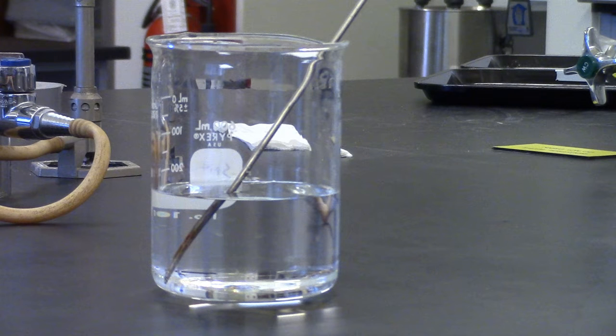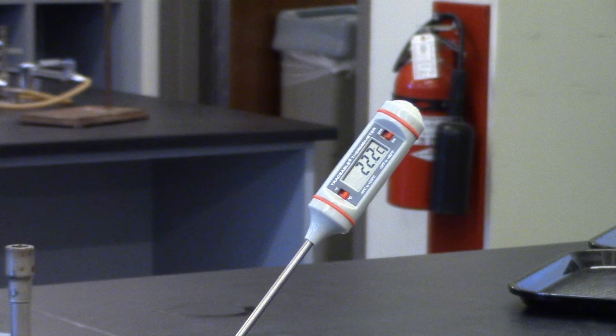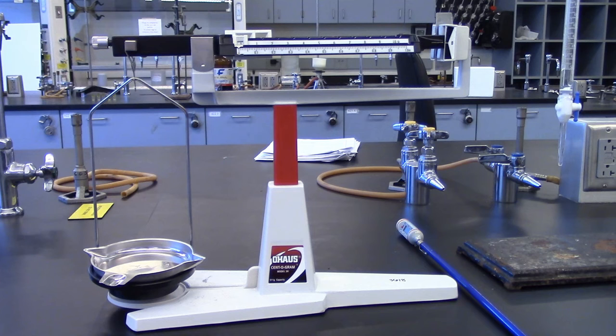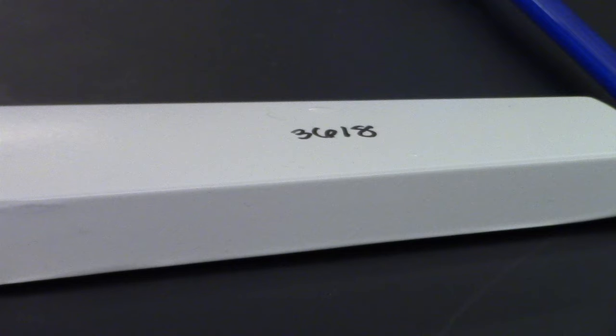Fill your 600 milliliter beaker with about 250 to 300 milliliters of distilled water and measure the temperature of the water. Obtain a quadruple beam balance and record the number.